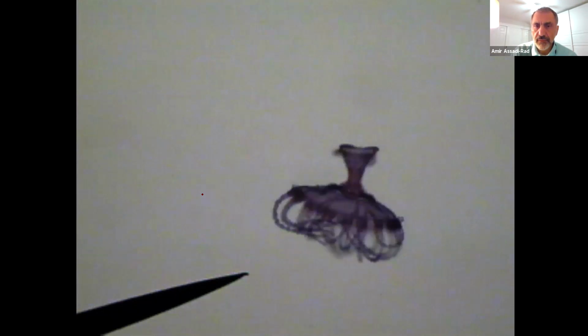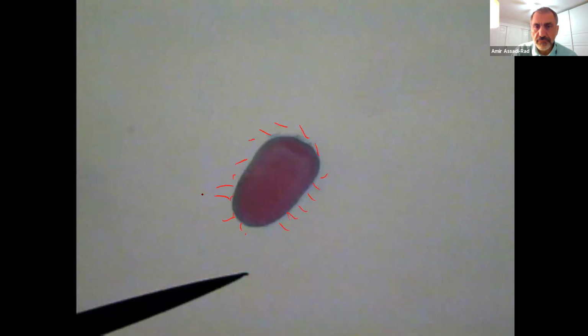This is a planula larva. I talked about the life cycle of it in the lecture. And of course, phylum Cnidaria, class Hydrozoa. The name of the organism is Obelia.